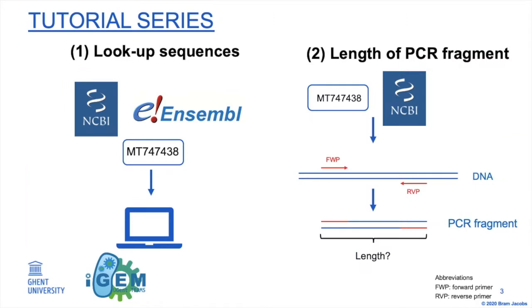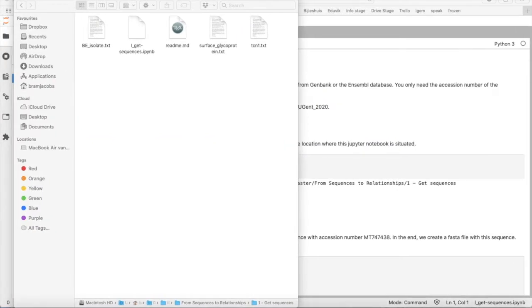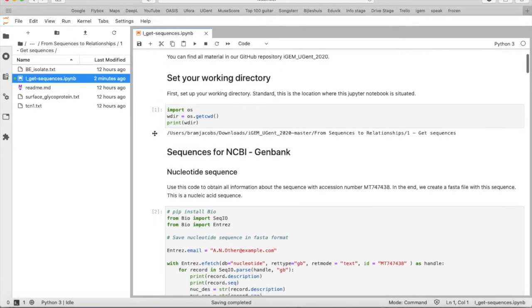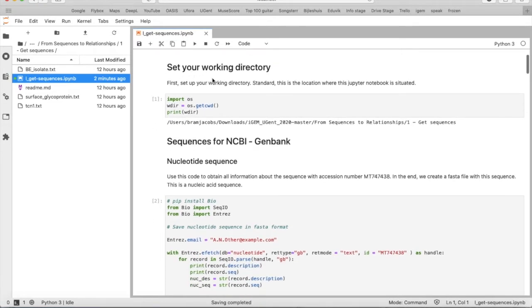What will we do? We will look up some sequences directly from the web. So you will need this first notebook, the one get sequences, and first of all you will set your working directory.